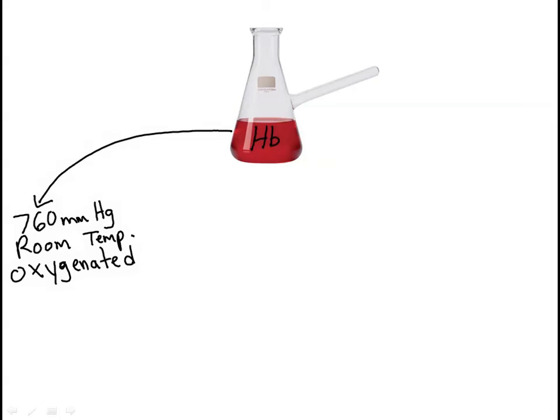You will briefly and gently agitate the sample and then read the absorbance at 660 nanometers on the spectrophotometer. And in the hemoglobin saturation calculation that you're given in LabTutor, this absorbance value is C. And the C term in the equation is the absorbance of the fully oxygenated hemoglobin.